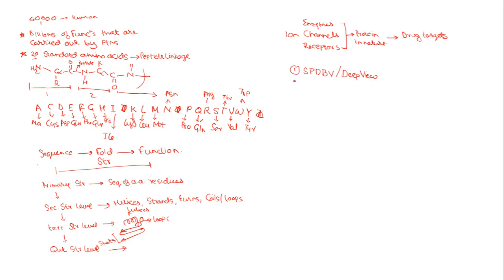Okay, so now there are other options available. People might use Chimera, they can use VMD for doing the same stuff. If you are working at a very elementary level, even RASMOL is very handy, but I have selected Deep View for most of the practicals because it is quite visual. You don't have to remember any commands in order to visualize your protein molecule or perform structural analysis. It is completely dependent on a graphical user interface, so it becomes easier for you as a beginner to start out with such a program.